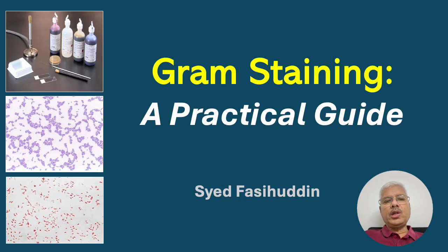Gram staining is a crucial technique in microbiology that is used to differentiate bacteria into two major groups, that is gram positive and gram negative. This differentiation is based on the structure of the bacterial cell wall. Gram staining is a simple and rapid procedure that can provide a preliminary identification of bacteria within a few minutes.